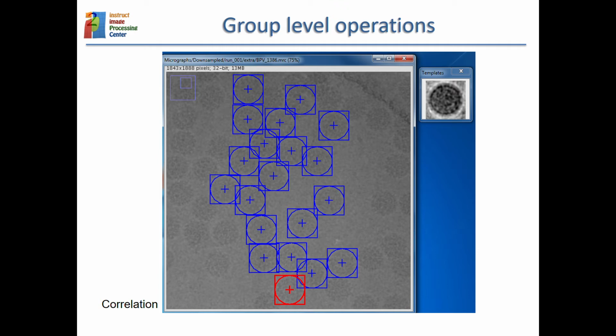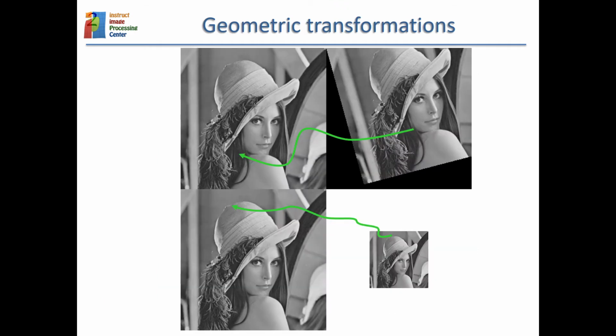And this is important because what we will see later is that very often some particles are missed, and many others that are really non-particles are accepted as particles in the micrographs, and so these decision algorithms that come afterwards really become very important.